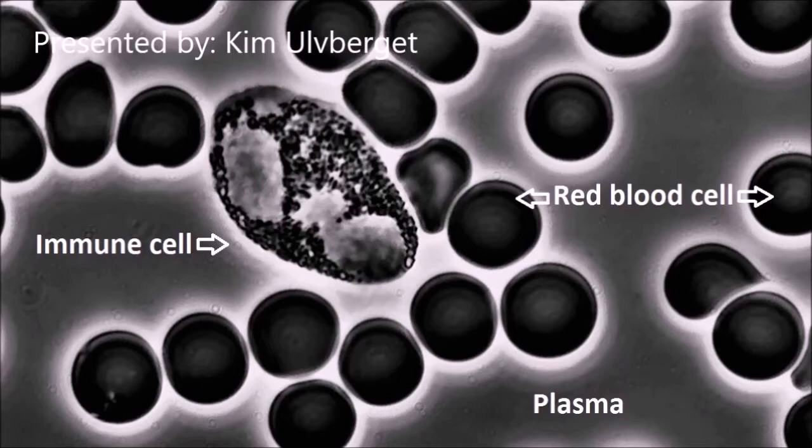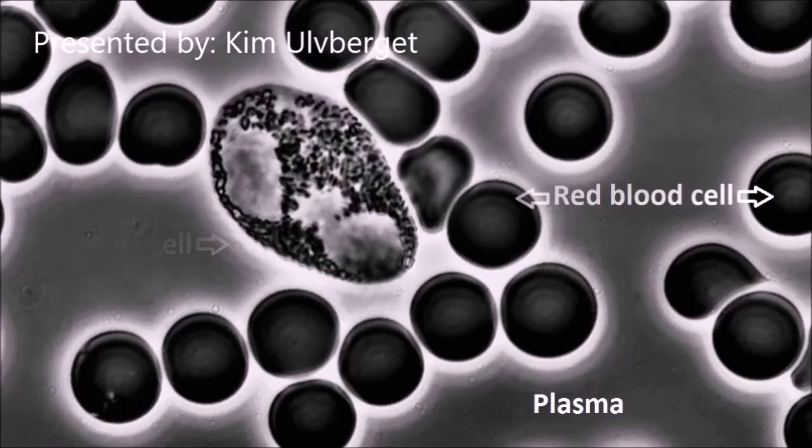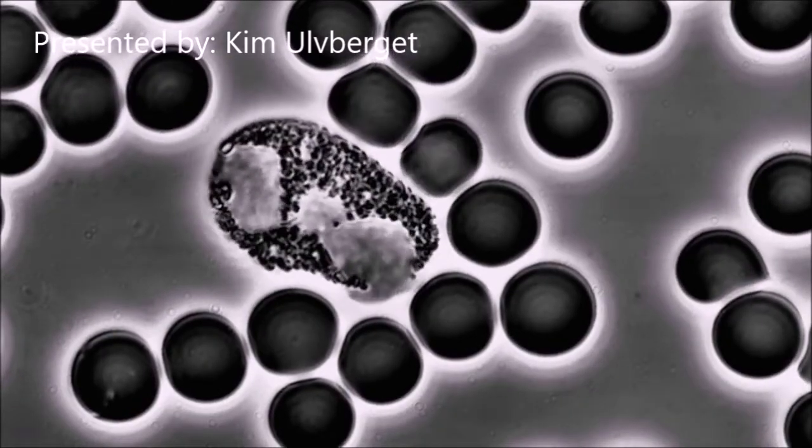The red blood cells have a smooth color and shape. They move around freely and they do not stick together. This is the first sign of a healthy environment in the blood.